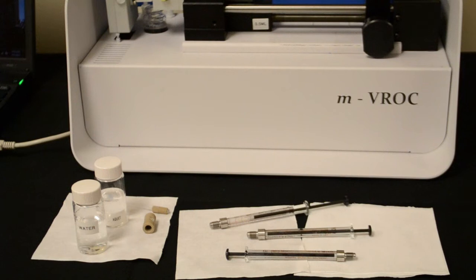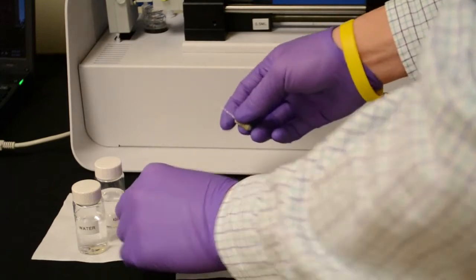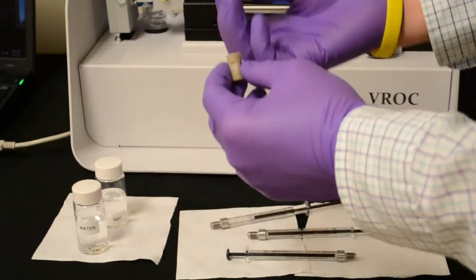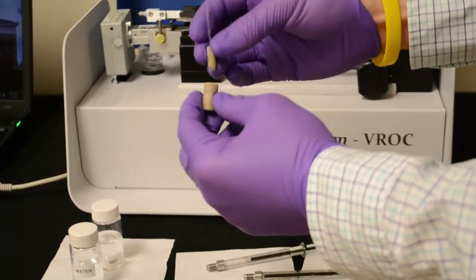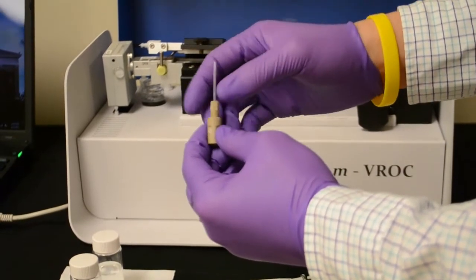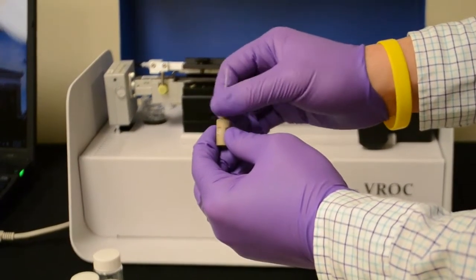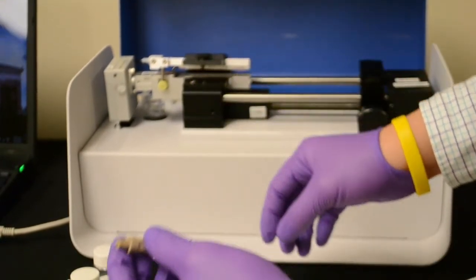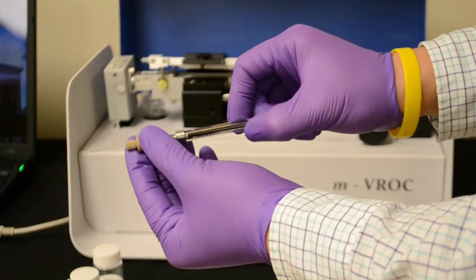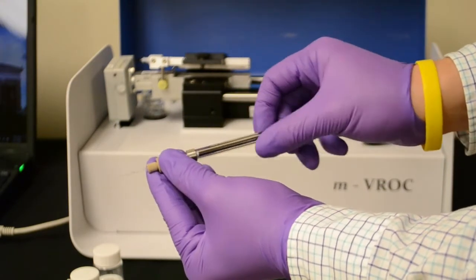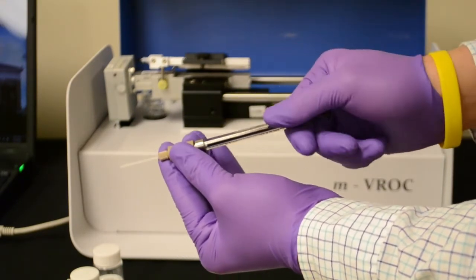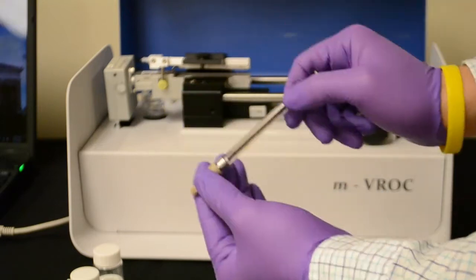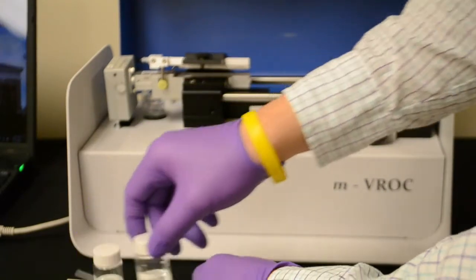Before we start to set up our equipment, let's load the water sample into the glass syringe. First, you would secure the plastic needle onto the union. Then, you would assemble the union onto your glass syringe. Once the syringe is secured, you may start drawing your sample.